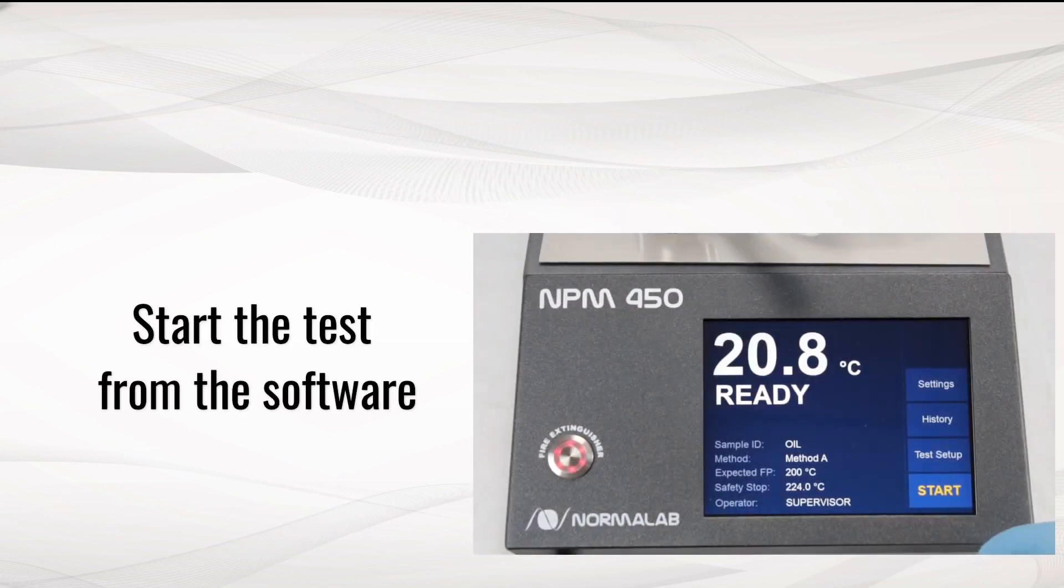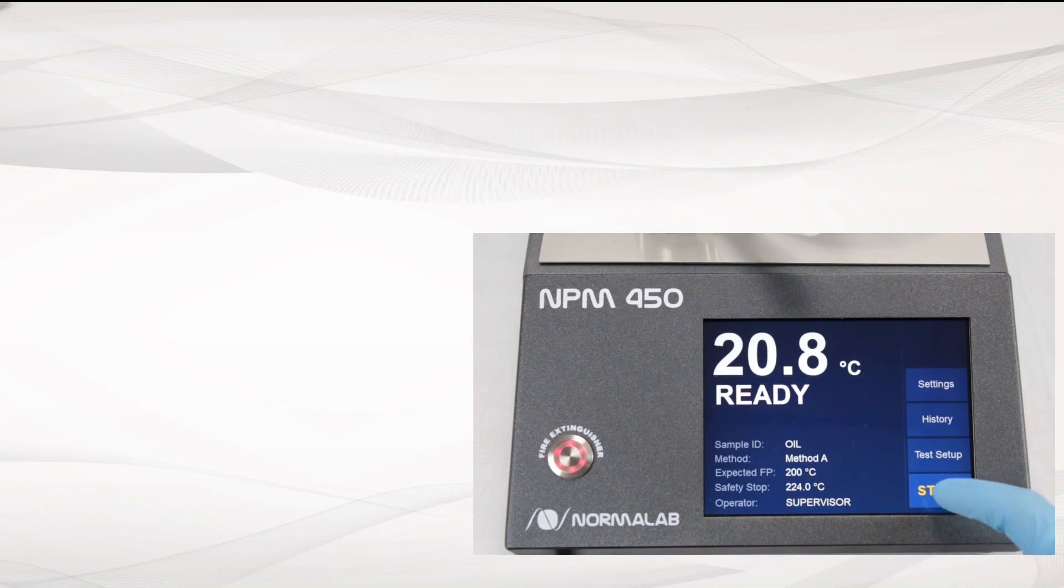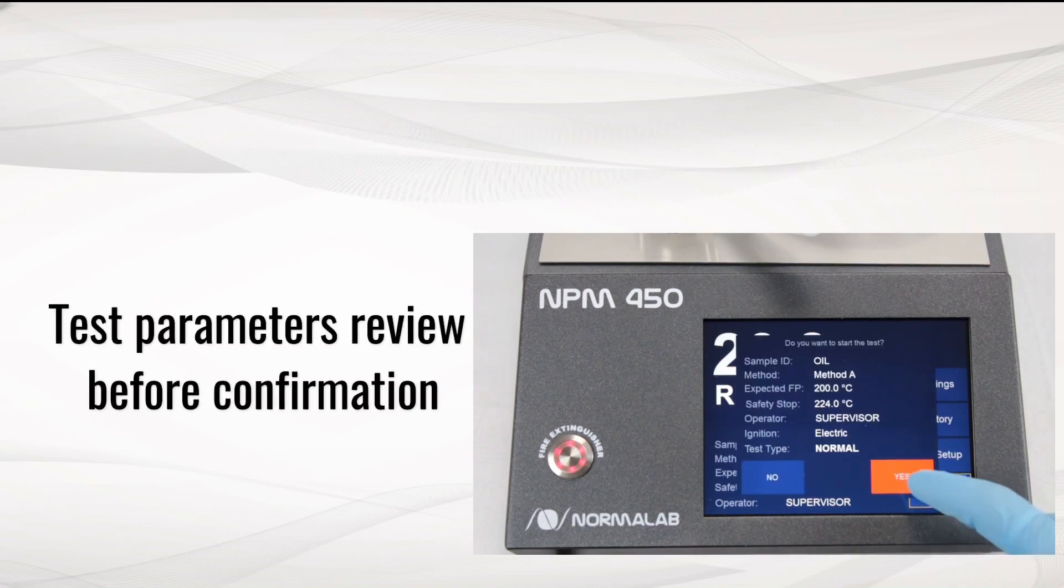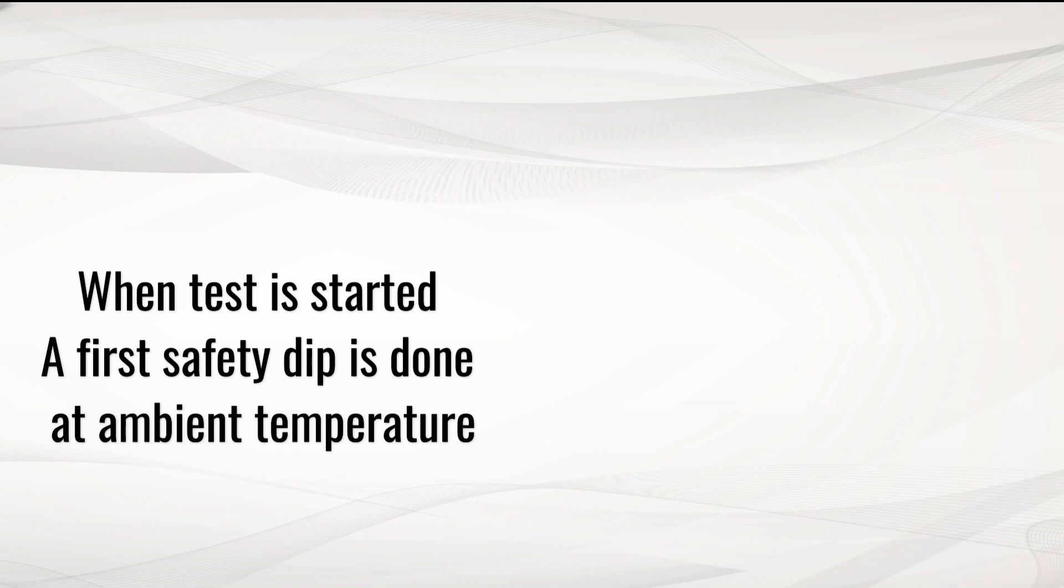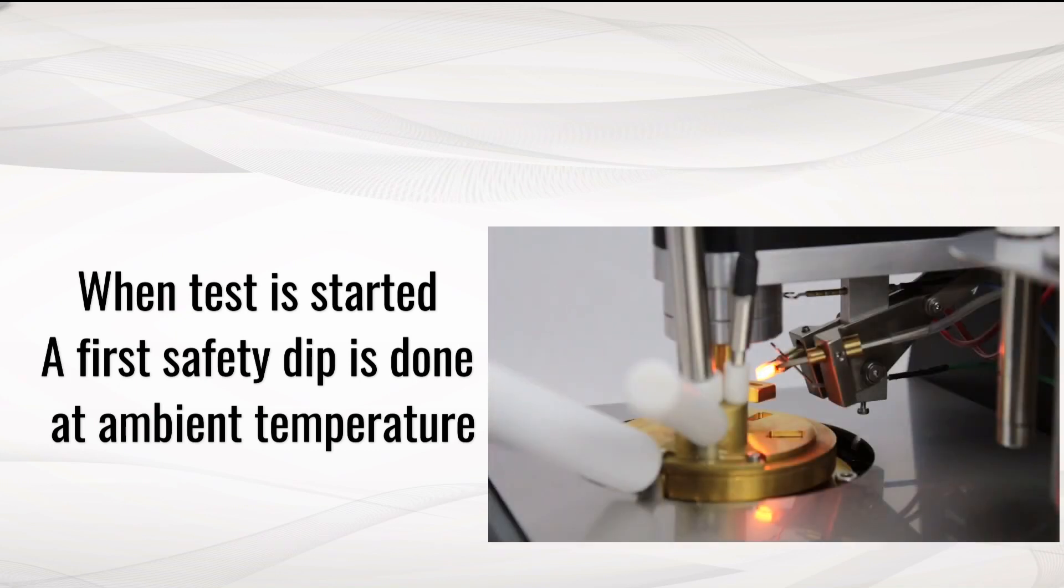Start the test from the software button and confirm test parameters review. When the test is started, the first safety dip is done at ambient temperature.